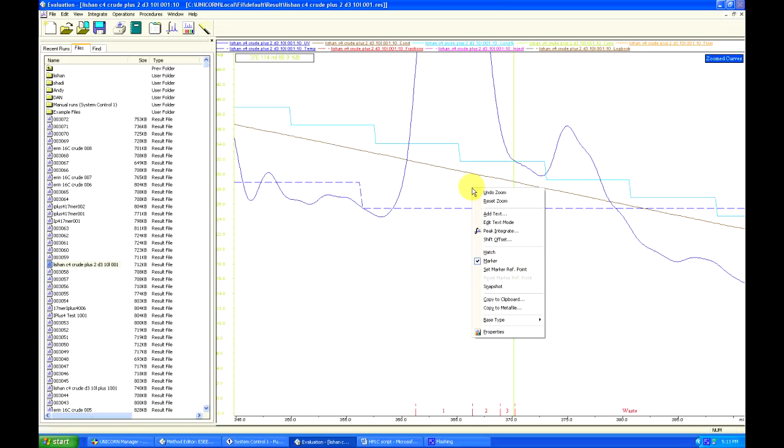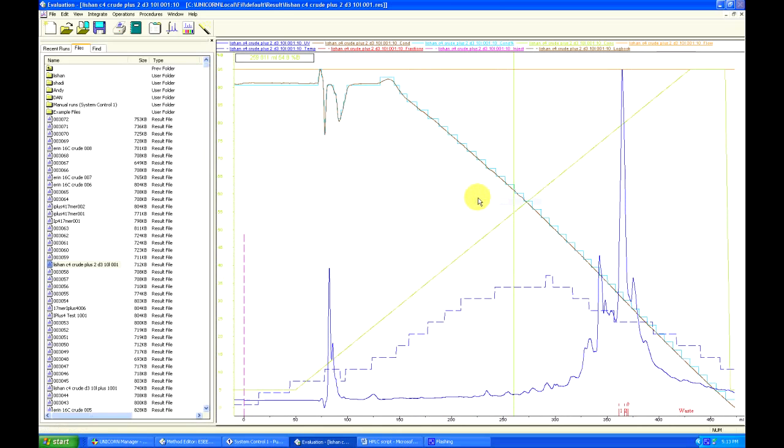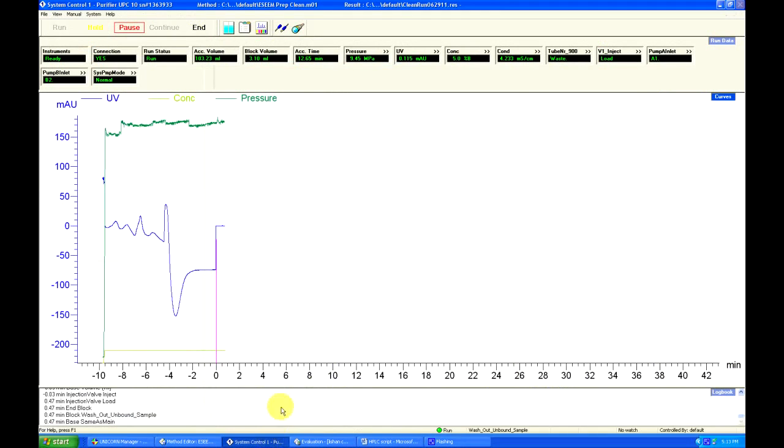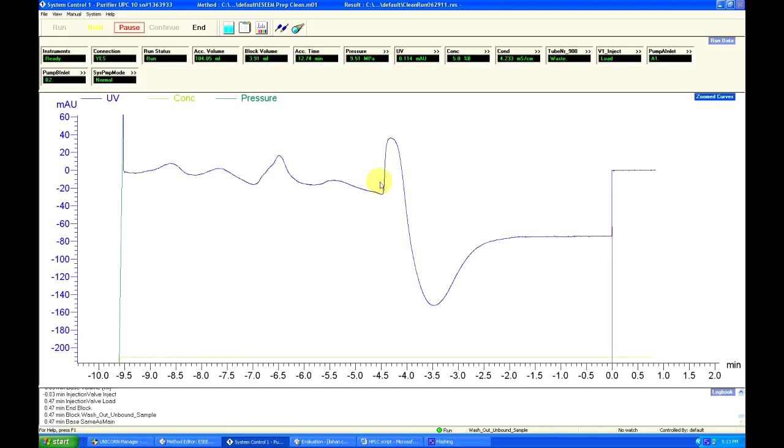Right click and reset zoom resets the zoom, or undo zoom if you want to undo the previous zoom, but not reset the whole thing. This nifty zoom function and the marker are also available in the system control window, so you can actually look at the peaks close up while they're eluding, as well as analyze what percent B they're eluding at.